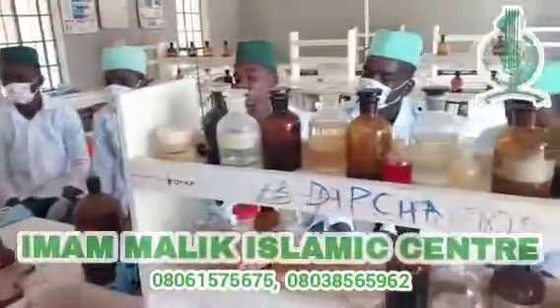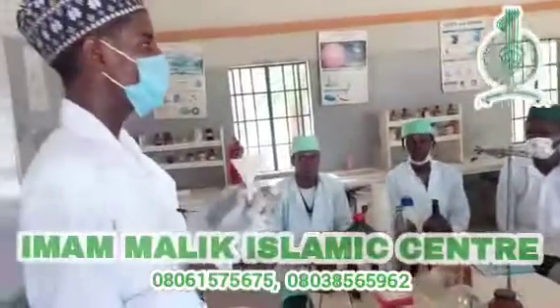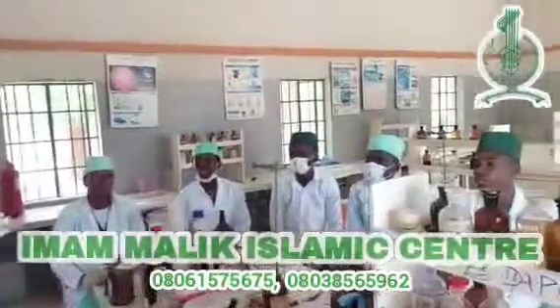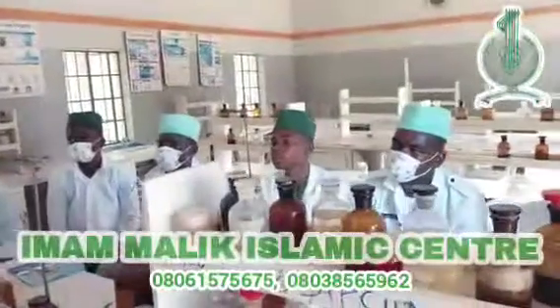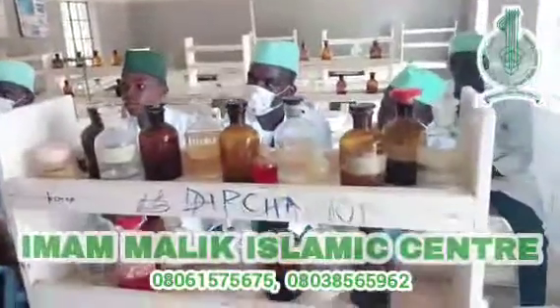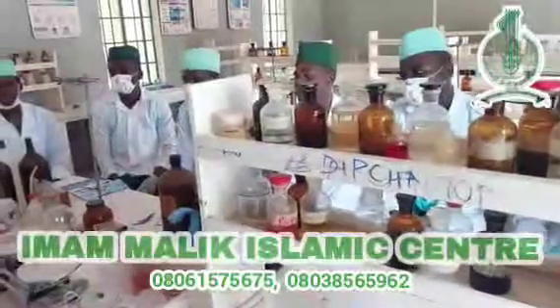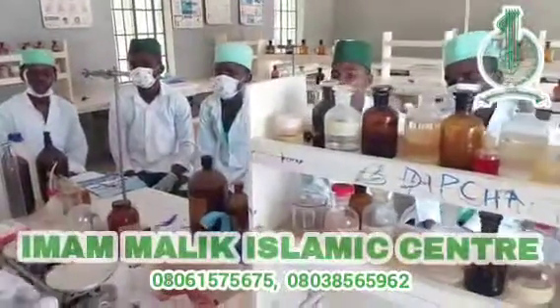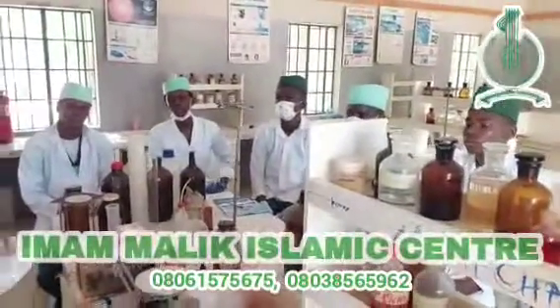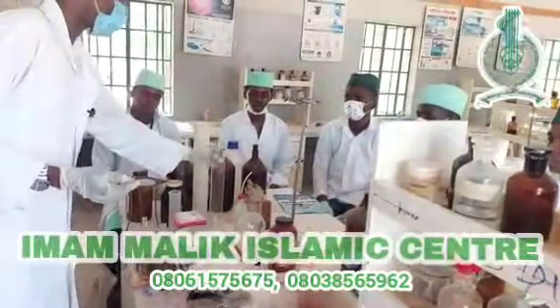And also, you can use this same funnel for filtering. How? By using filter paper. If you put filter paper into it, you can use it to filter out, to separate the residue from the filtrate. So this is also another function of the funnel. And we have the measuring apparatus, as we have said earlier. The measuring cylinder is a very good measuring apparatus.